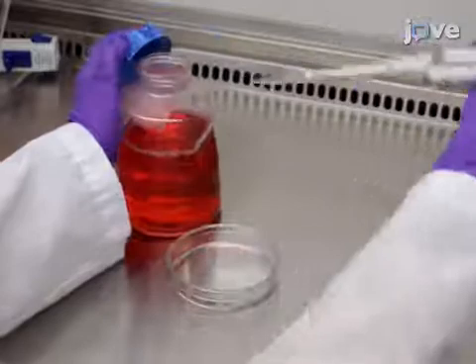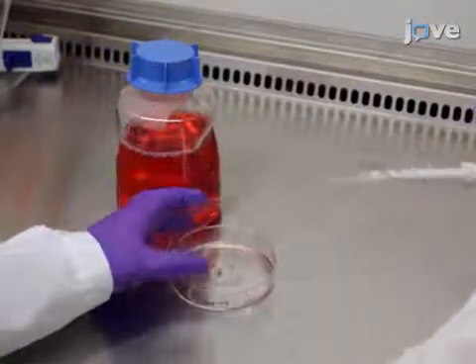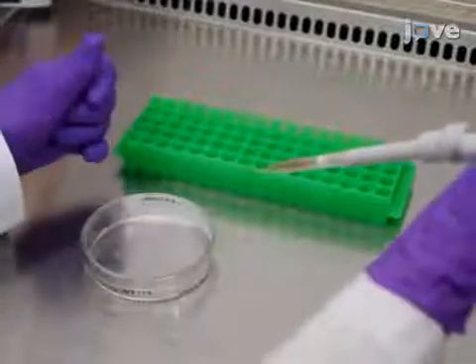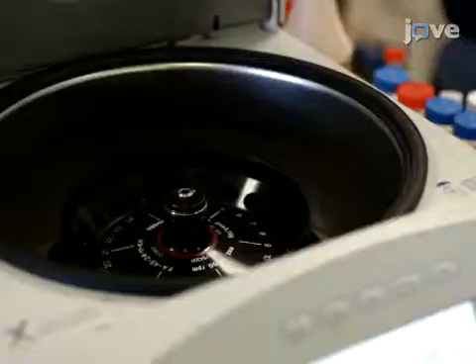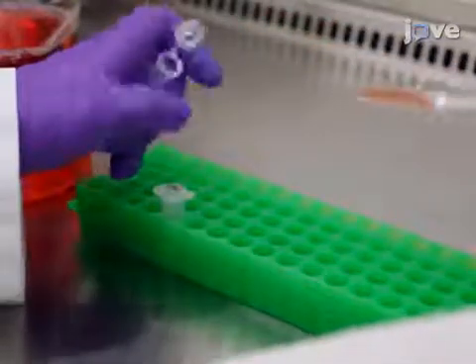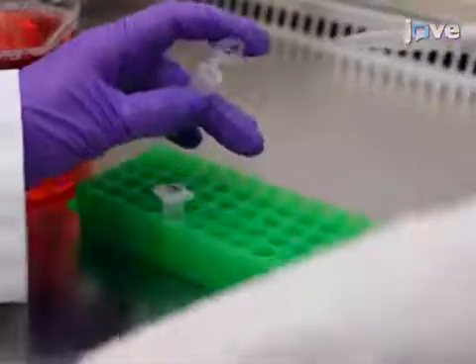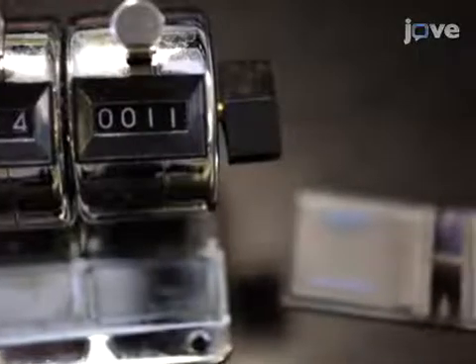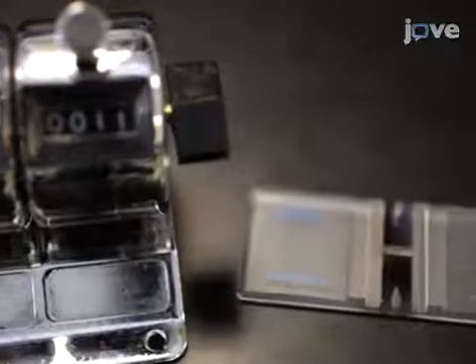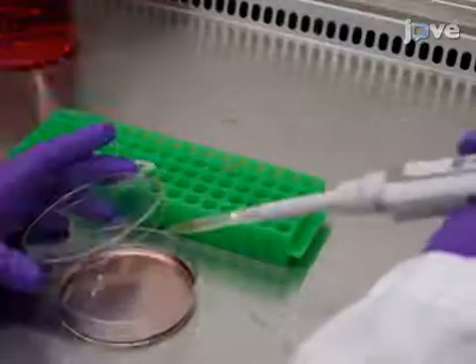Afterward, add 0.5 milliliters of IMDM to neutralize the trypsin reaction and pipette the cells into a 1.5-milliliter tube. Next, spin the cells at 500 times g for 5 minutes. Re-suspend the cells in 1 milliliter of IMDM and dilute 10 microliters of cells in 90 microliters of PBS. Count the cells using either a hemocytometer or an automated cell counter and replate the cells with complete IMDM.